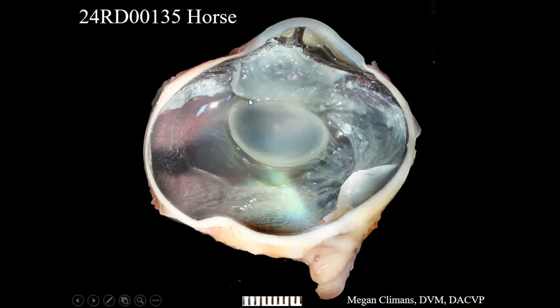Okay. So the gross hemisected view of this eye, we have a cloudy cornea. Interestingly, the anterior chamber is pretty narrow. So here's the iris, and here's the ciliary body. And so the anterior chamber would be up here, and there's barely any anterior chamber there. There's presumably some degree of synechia. You can see the iris kind of sticking to the cornea here, for example.